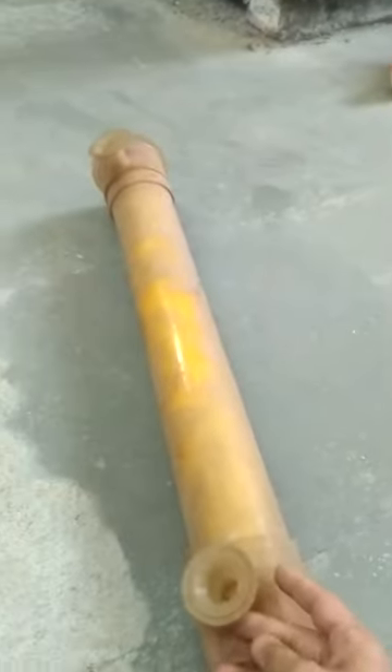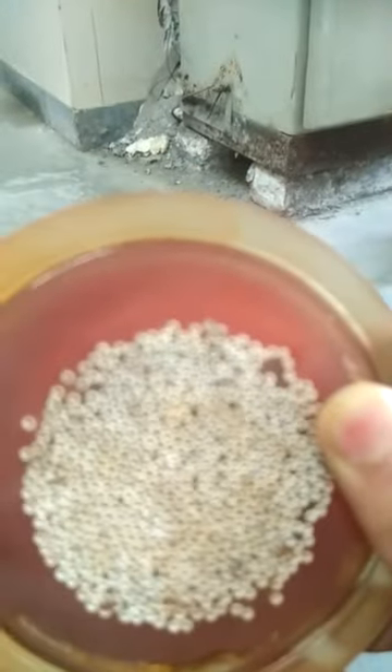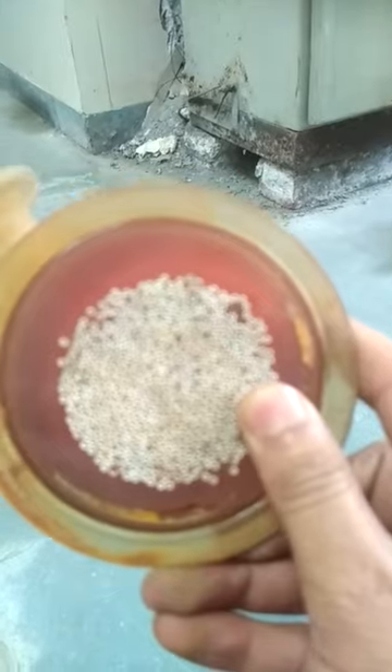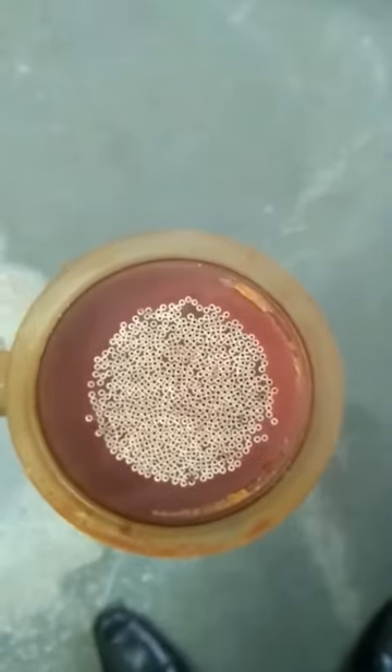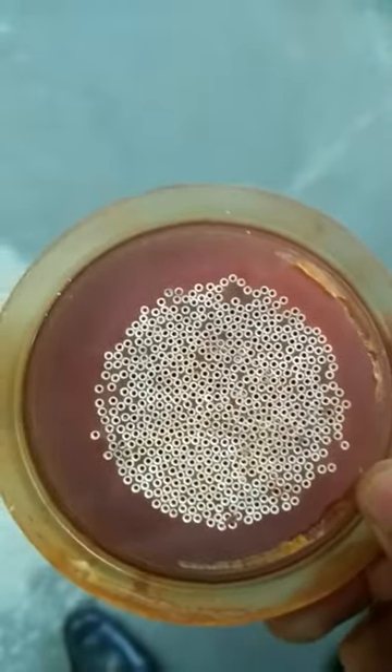This is a hollow fiber membrane module. Here we can see it is just like a shell and tube heat exchanger, but in this case on the tube side we are seeing the fibers. In these fibers there are very small holes, which are used to circulate the fluid required to flow through this membrane for separation.